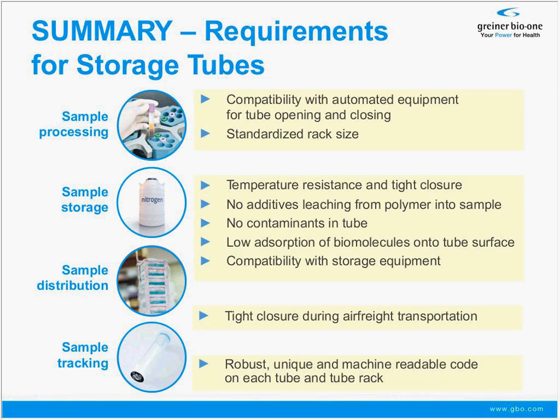So I want to list the tube requirements for storage tubes for a good biobanking approach. For sample processing, we can deduce that tubes must be compatible with automated equipment for tube opening and closing, because this helps you with your processing time and the throughput within a given time. All standardized racks should be utilized because they allow for automated processing, not only at the stage of decapping and recapping, but also when it comes to aliquotation or processing of samples.